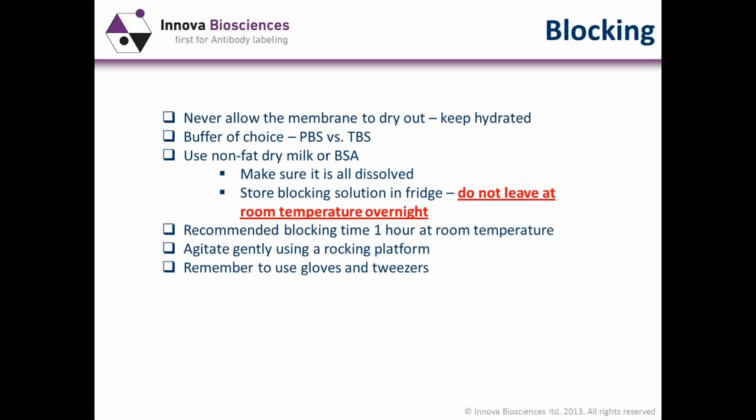Blocking, again, has some technical hints and tips which can be very useful here. One thing is, never allow your membrane to dry out. As I said, once you've done your Ponceau stain and washed away the residual Ponceau, don't allow it to dry out. Keep it in the water, or get it into the transfer buffer as quickly as possible. If you leave it on the table dehydrating, it's not going to be beneficial to your downstream steps.